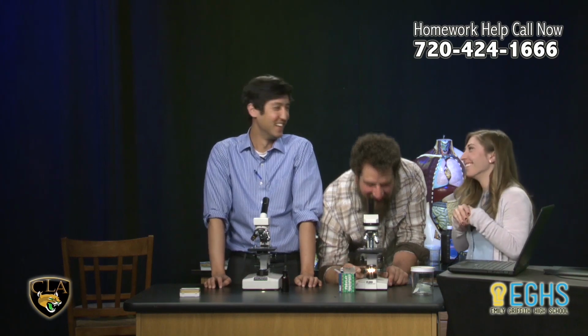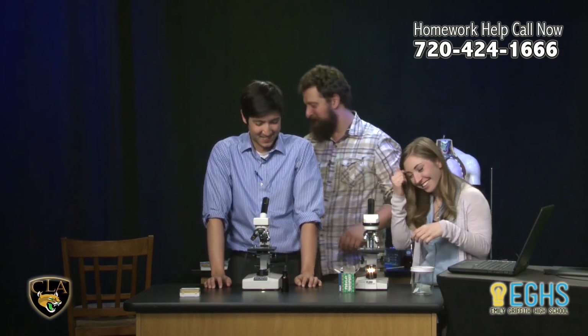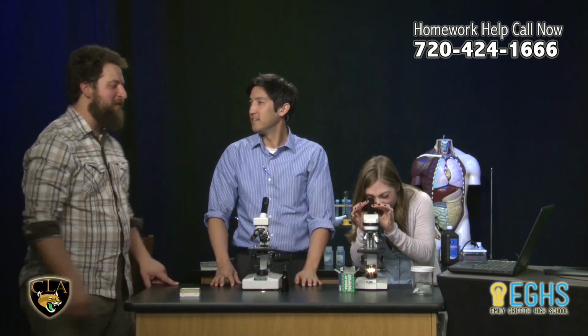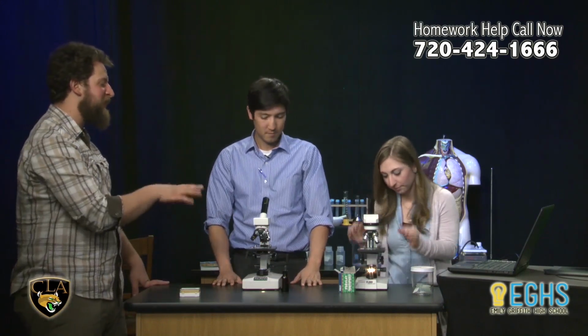All right, so Becca's got one of her cheek cells pulled up into pretty good focus at the highest magnification. So Becca, what I'll have you do is just adjust the fine focus a little bit, try to get that perfect position, and then I'm going to talk to you about photographing. In the meantime, Nate, thank you, patient students. I follow instructions. Okay, that's right.